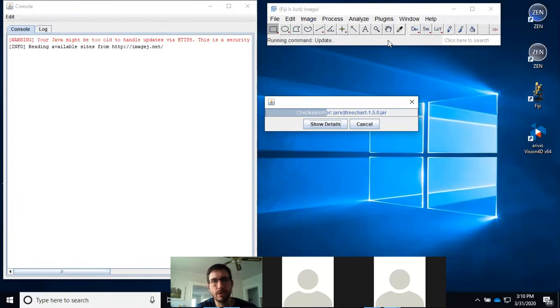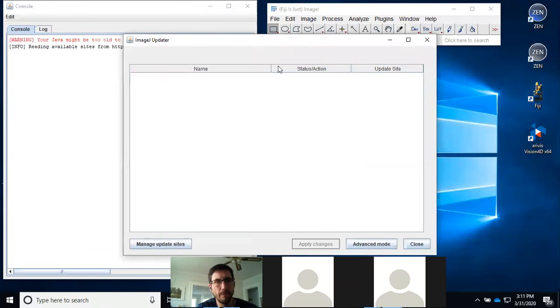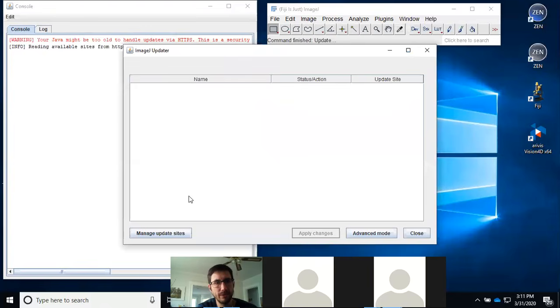I'm just going to show you a couple of these once this chugs along here. There we go. So this, I obviously ran it this morning when I was practicing this, so there's nothing to update. If there was, it'd be listed here.